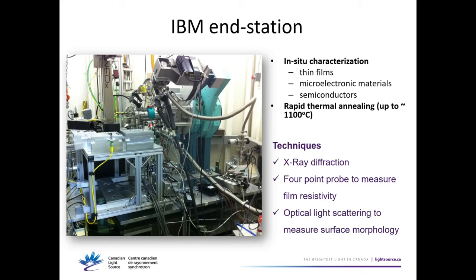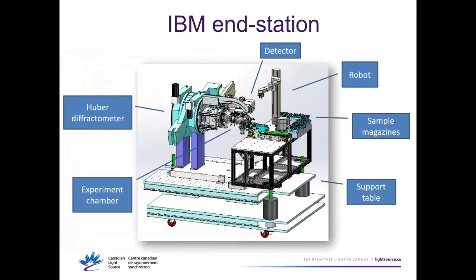The whole point of doing this is to study how stable these films are during thermal annealings, which are common during the processing and production of these chips. When you have to grow different layers and do different processes, you have a given thermal budget. So you want to make sure you know your thermal budget and how these materials will endure this thermal cycling.